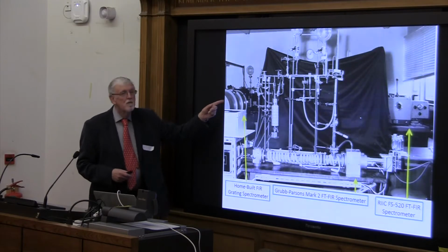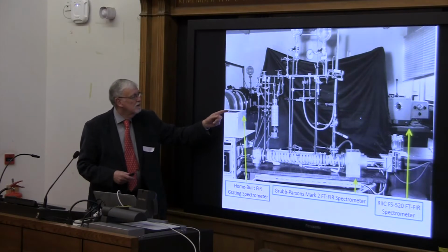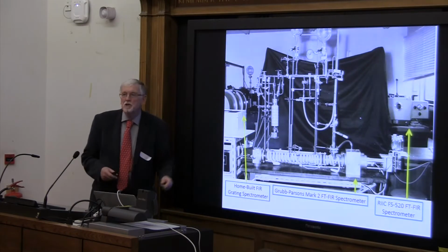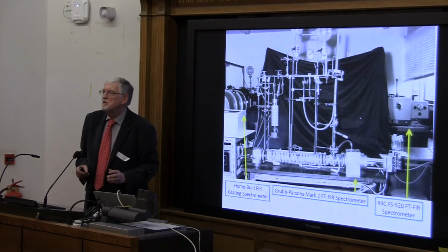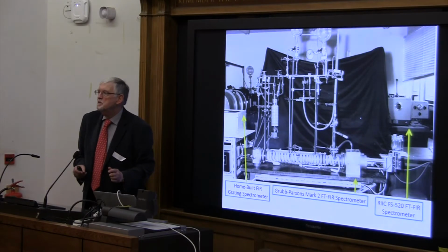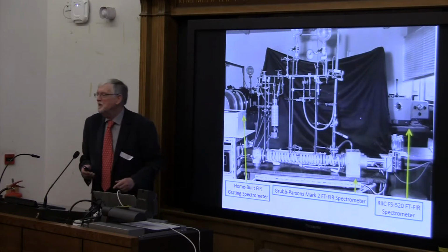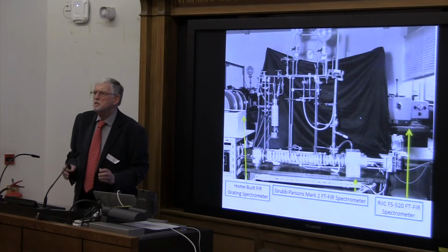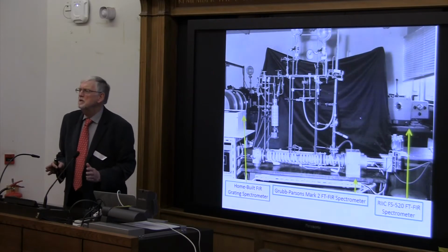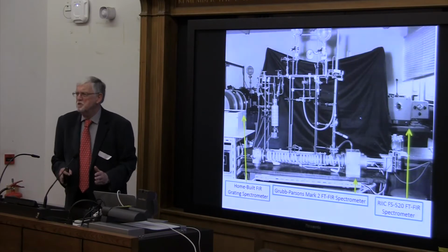This was actually a homemade far-infrared spectrometer that Tommy had made previously, which all the time that I was in his lab managed to get one spectrum during the time that we were using these other two instruments. It was still difficult to persuade Tommy that an instrument that worked without a grating or a prism could actually produce a spectrum.